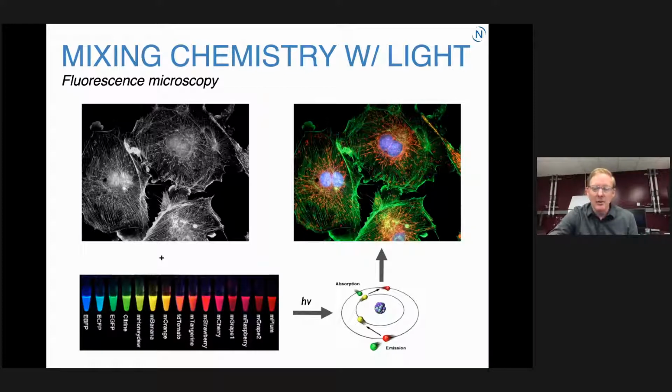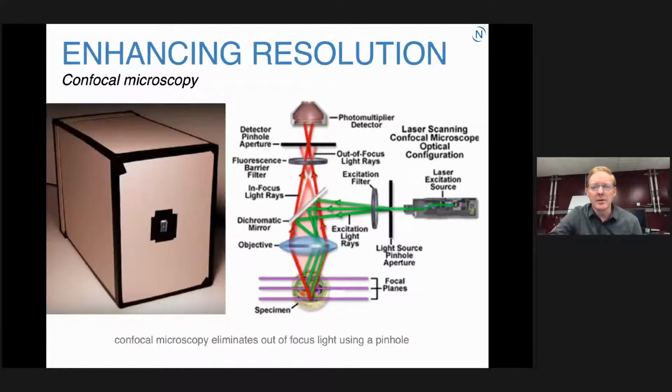Some of you may be familiar with sort of ultraviolet, like black light paintings. We're basically using similar dyes to paint in a targeted way the structure of the cells such that we can not only see where things are, we can differentiate what they are. And that is a very sort of leap forward in the application of optical microscopes.